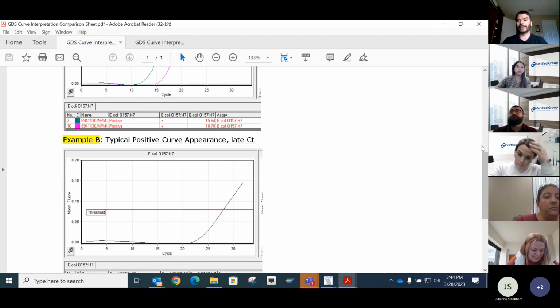There's very limited background fluorescence. A lot of times you'll see float in the lines, and that's just a little bit higher background fluorescence, but the algorithms in the software are crunching that data, and those lines will move across horizontally. Either you see them above or below the line, either one's perfectly normal within our system.